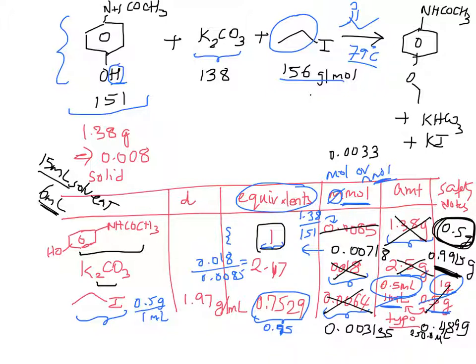You would then wash it with 5% sodium hydroxide solution. That will take care of any unreacted acetanilide, if at all. It's a good idea to do a TLC before and after because that will clarify your organic layer. You dry your organic layer, you rotary evaporate it, and you get your final product. And that's the lab.